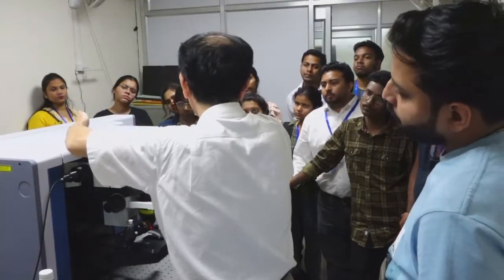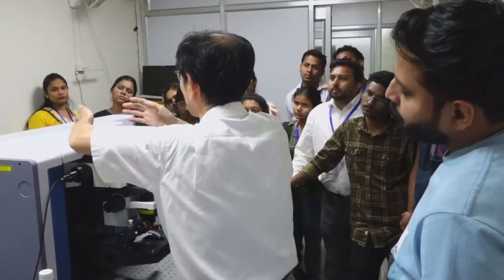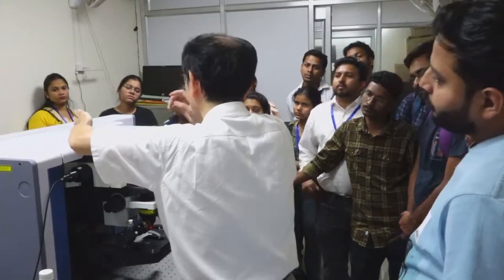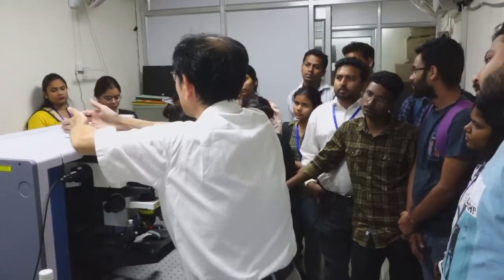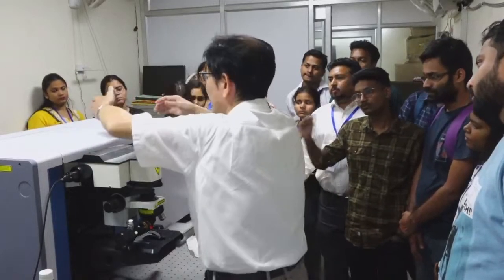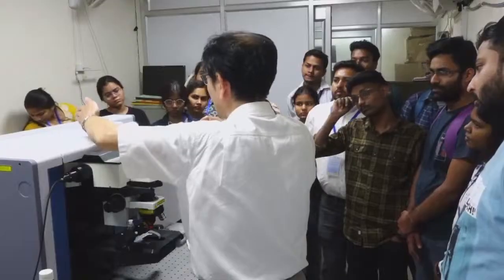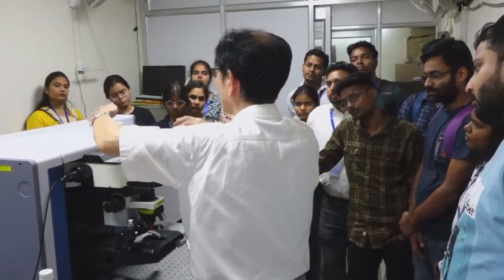But for the Raman signals, it is a mirror because they are above the cut-off wavelength. So the Raman signal is reflected and goes into the monochromator. So this is the optical element that separates 633 and the Raman signals.